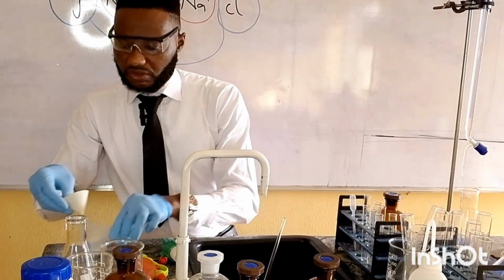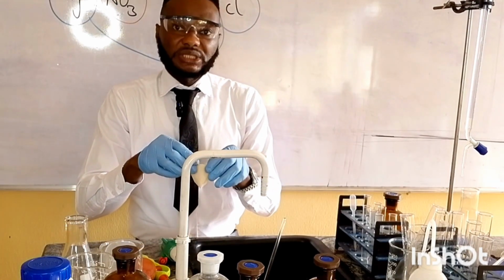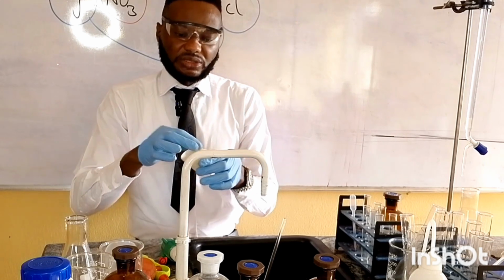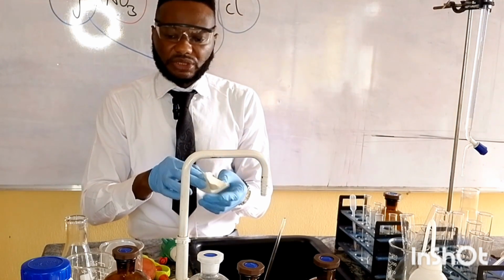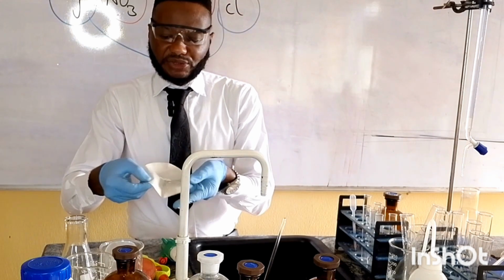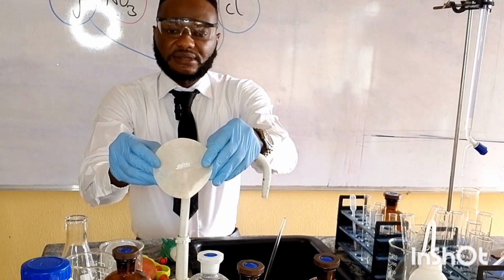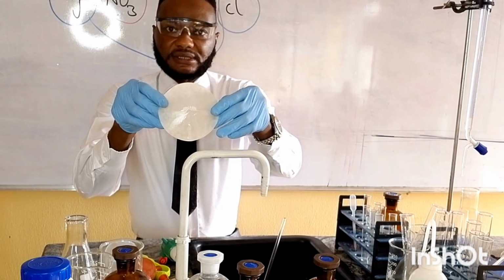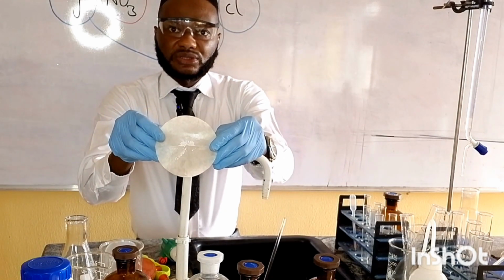So we just prepared an insoluble salt in the chemistry laboratory. So this is our insoluble salt. You can see it. Can you see it?